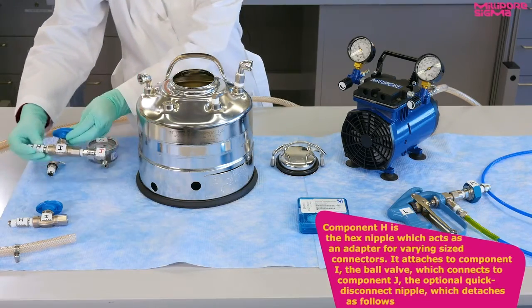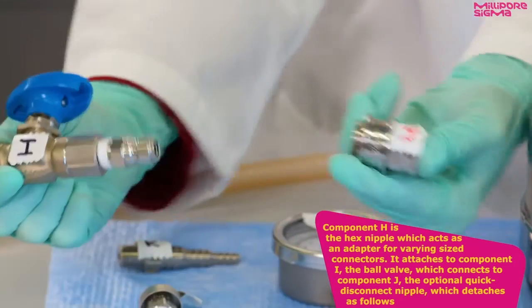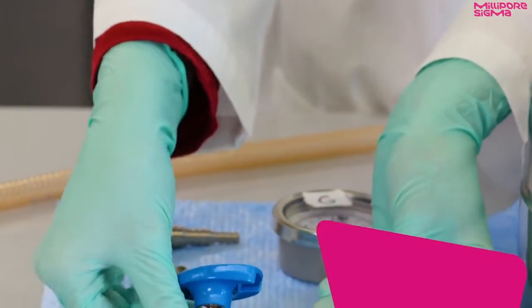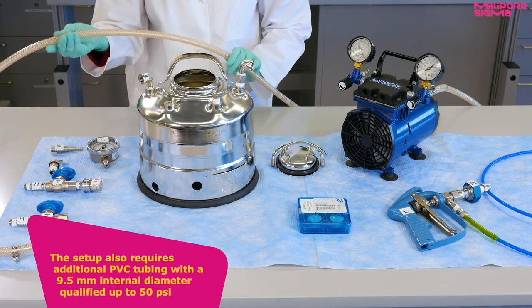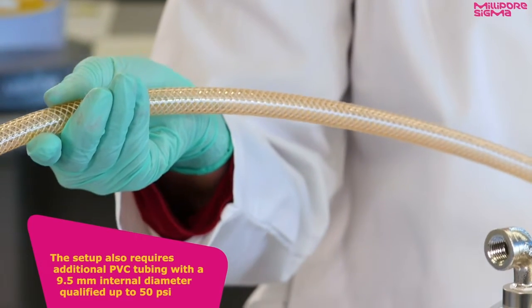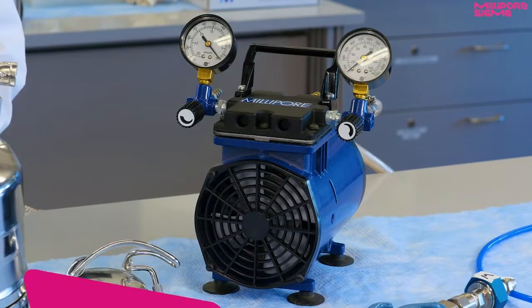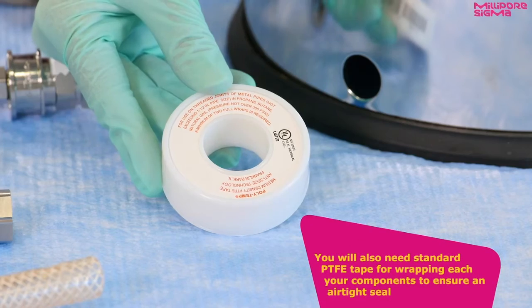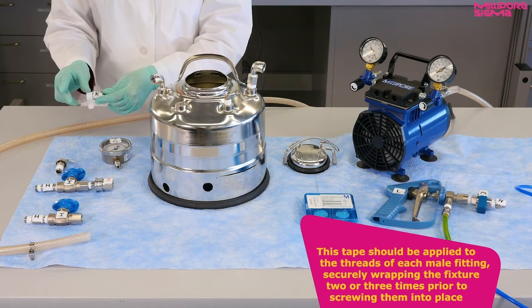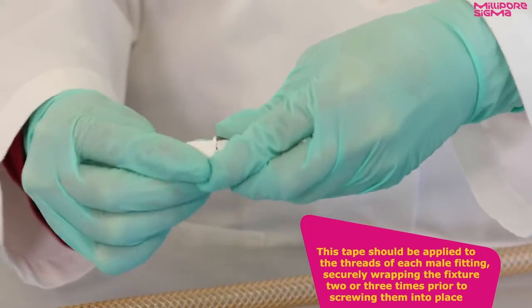Component H is the hex nipple, which acts as an adapter for varying-sized connectors. It attaches to component I, the ball valve, which connects to component J, the optional quick disconnect nipple. The setup also requires additional PVC tubing with a 9.5 mm internal diameter qualified up to 50 psi, as well as a standard high-output pump capable of positive pressure. You will also need standard PTFE tape for wrapping each of your components to ensure an airtight seal. This tape should be applied to the threads of each male fitting, securely wrapping the fixture two or three times prior to screwing them into place.